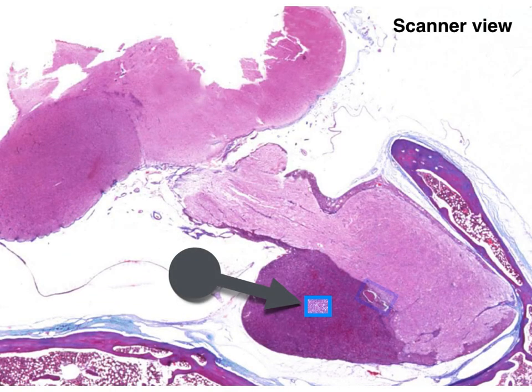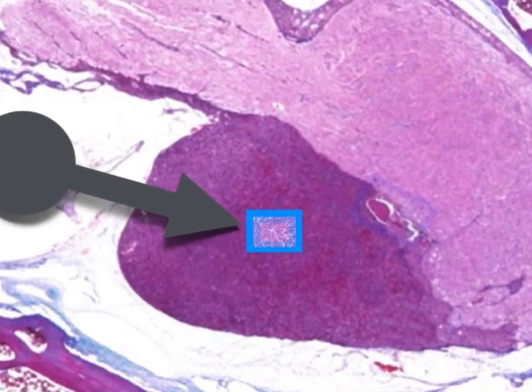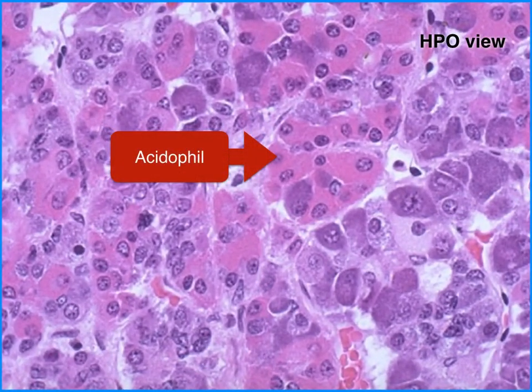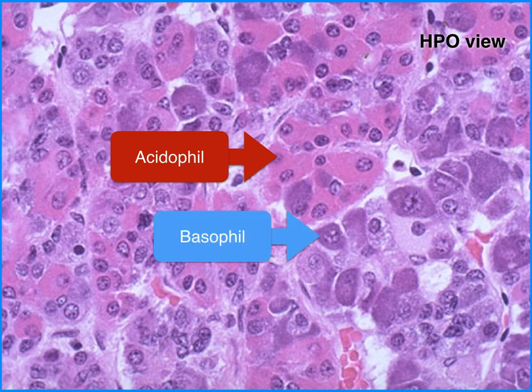Now let's move to the part of the anterior pituitary gland called the pars distalis. At high magnification, three types of cells are visible. The first is the acidophil, as shown by the red arrow. The acidophils appear as cells with pink cytoplasm and dark nuclei. These cells secrete growth hormone and prolactin. Shown by the blue arrow is the cell known as the basophil. In contrast to the acidophil, basophils appear as darker cells with purple cytoplasm. They secrete TSH, ACTH, FSH, and LH.